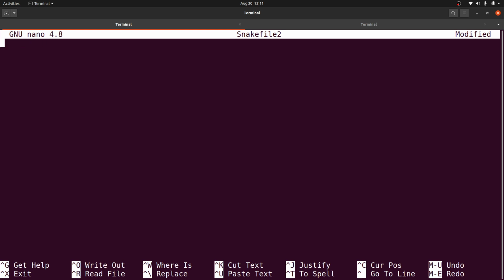So I'll just type rule, I'll say BWA_map. I bring my colon. Next line. I specify my inputs. I bring a colon. Next line.